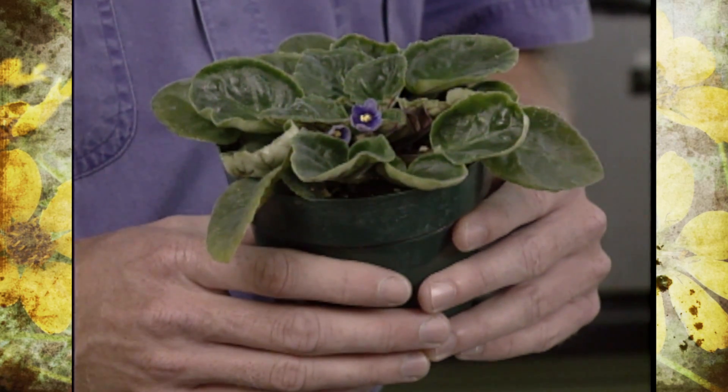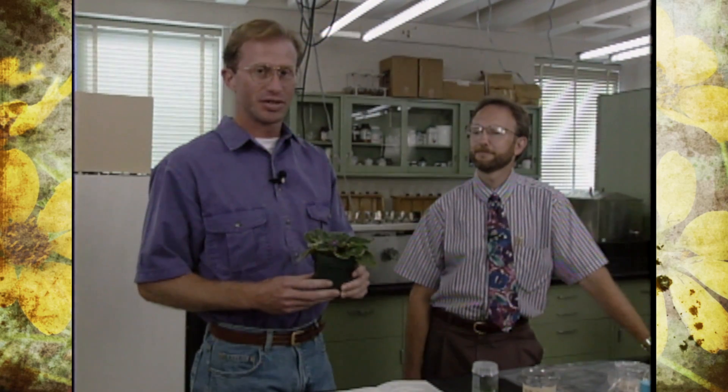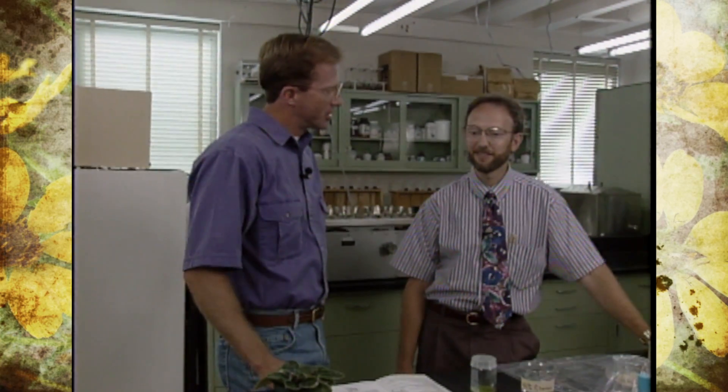Chances are you may have an indoor foliage plant or flowering plant that was actually developed or propagated by tissue culture. Joining me today is Doug Needham, Assistant Professor in Horticulture. Doug is going to help us understand this process a little bit more and maybe extrapolate it where we can actually do it at home. Tell us a little bit more about tissue culture — what it is and its pros and cons.